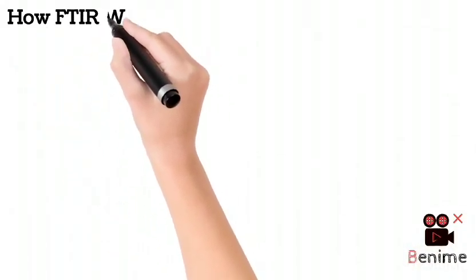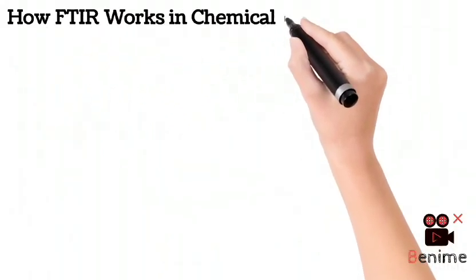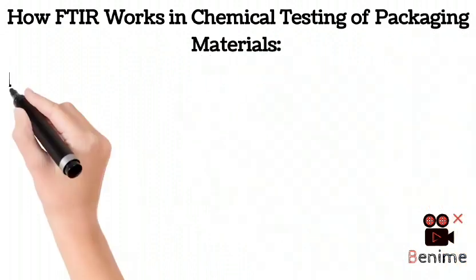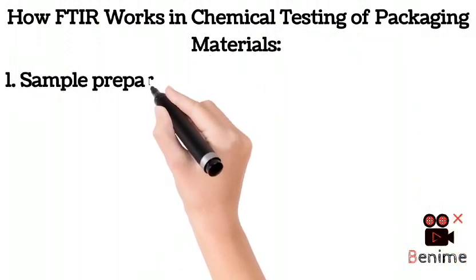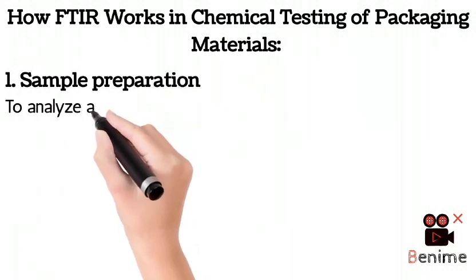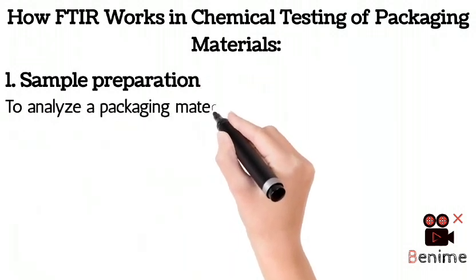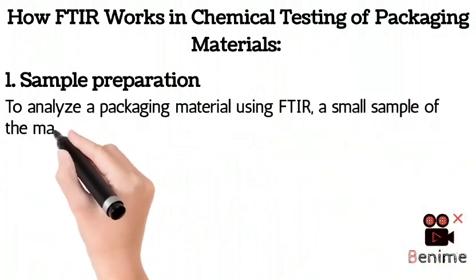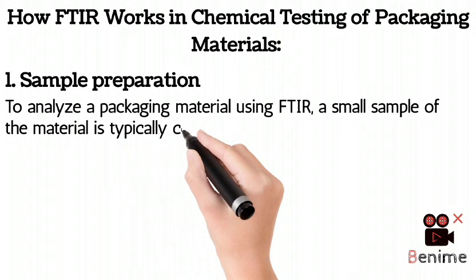How FTIR works in chemical testing of packaging materials. Sample preparation to analyze a packaging material using FTIR. A small sample of the material is typically collected.